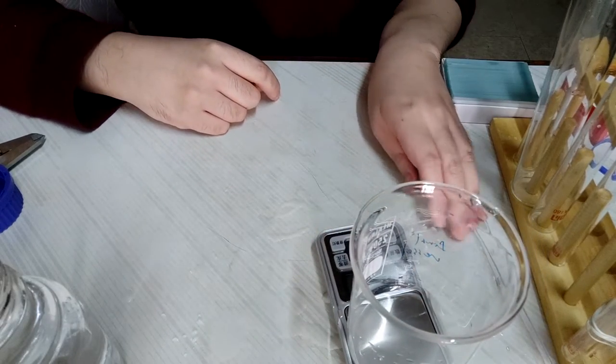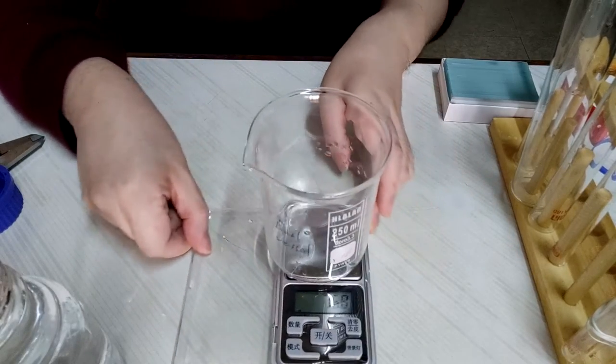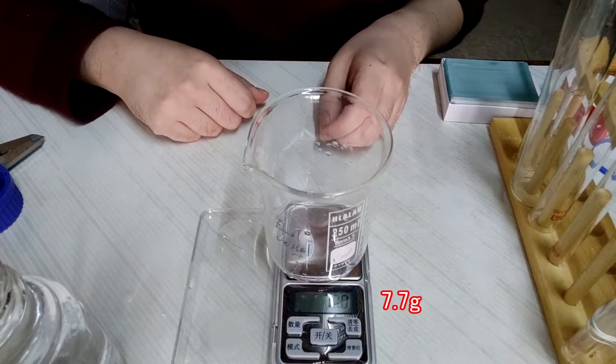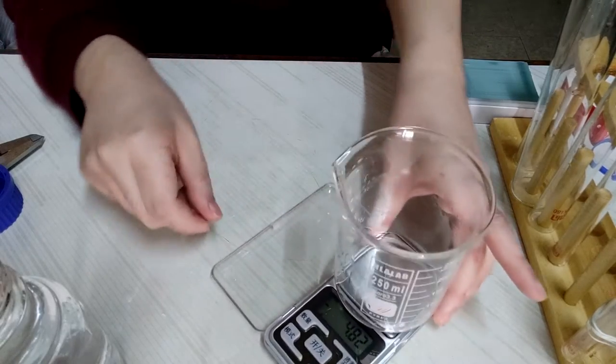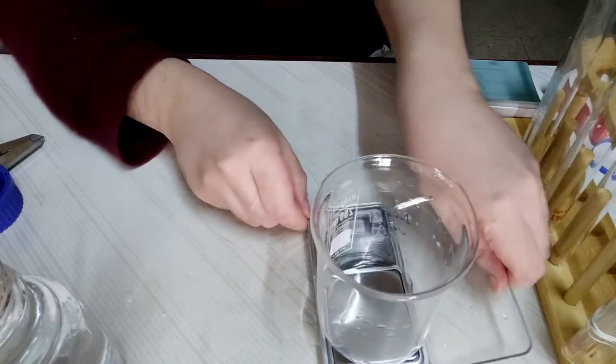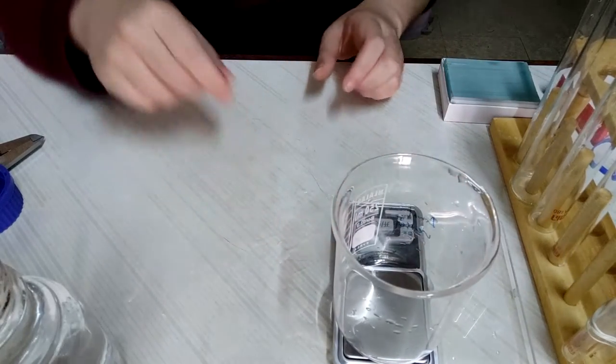Its capacity is around 7 to 8 milliliters. I dropped lots, so we can assume it will be closer to 10 milliliters.